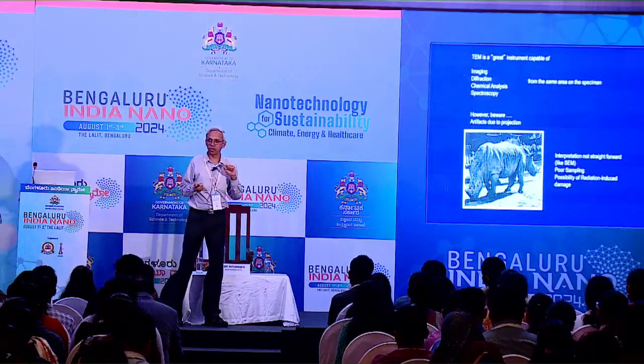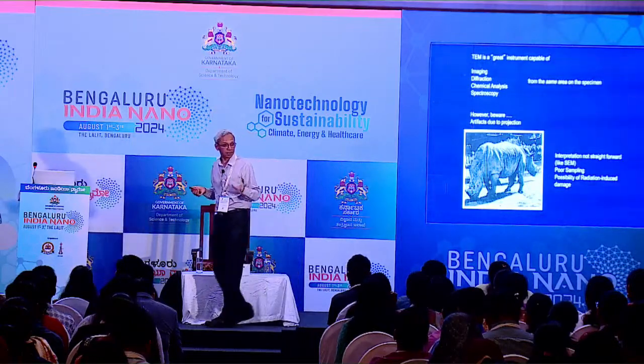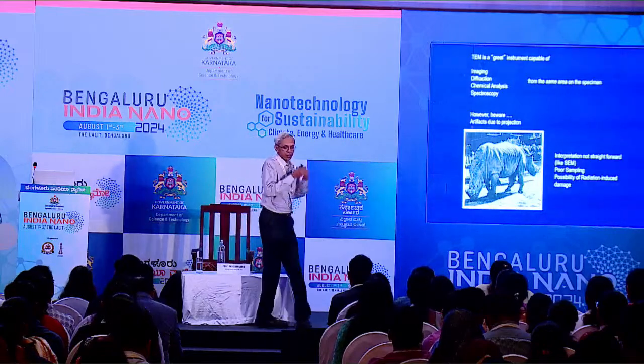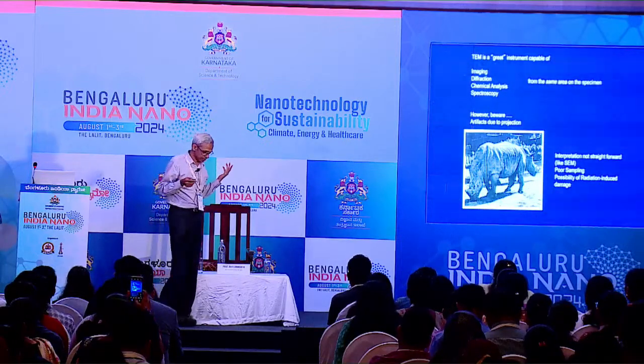The spatial resolution is what sets the TEM apart from all other techniques, and you can get all of this from the same instrument, same sample, same region. Okay, that is the power of the TEM. Of course, then why should everybody not be doing TEM and nothing else, right? It's not really like that, because the TEM also has its own problems and other associated things.